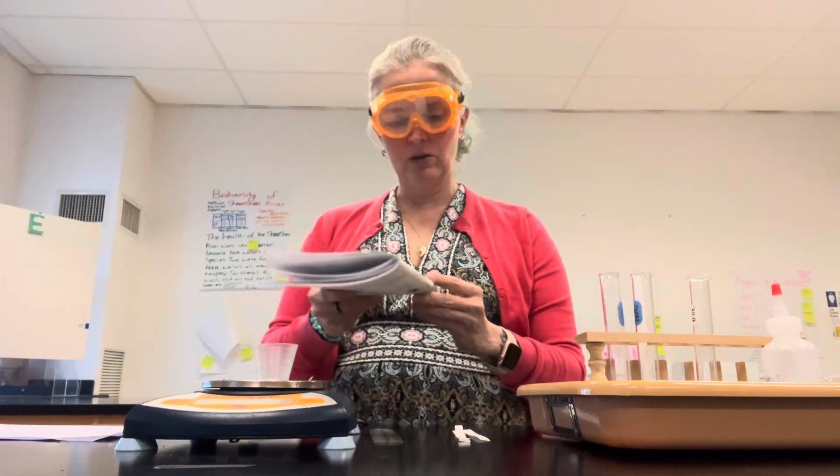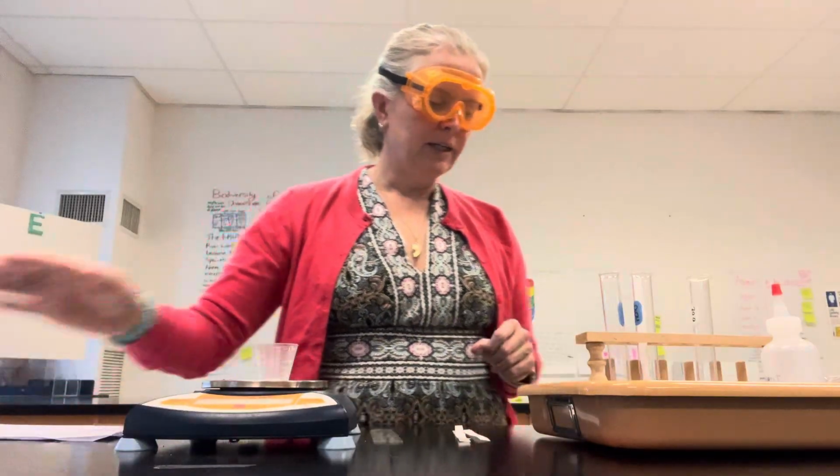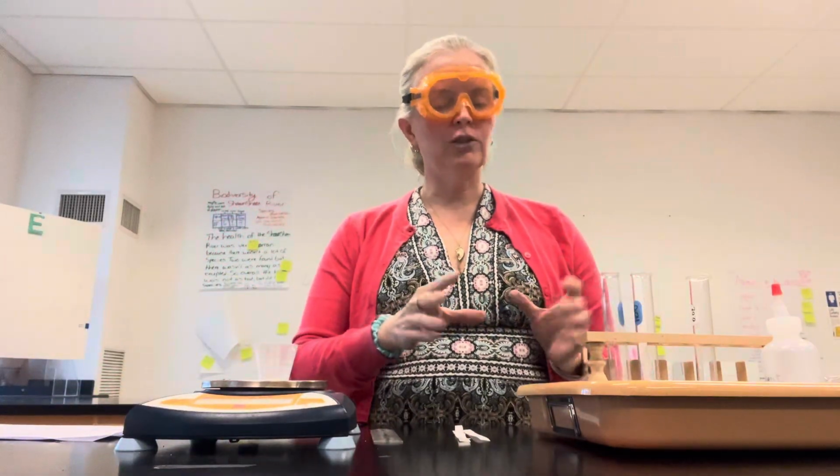So for this conclusion, it's a little different than our other conclusions. You are going to focus on identifying a suspect. You could say the suspect with the Crayola marker or the suspect with the Sharpie, for example.